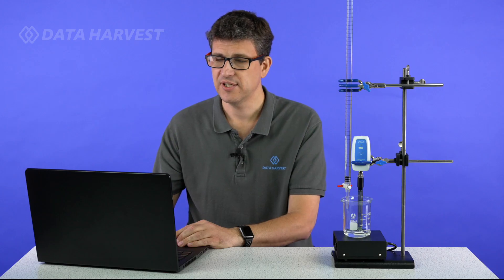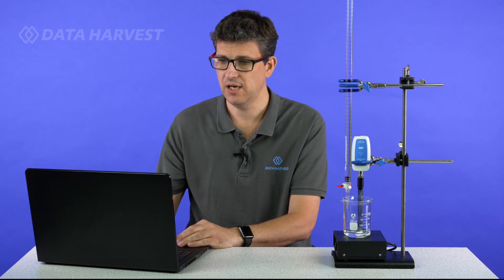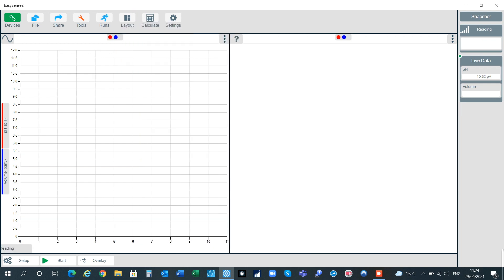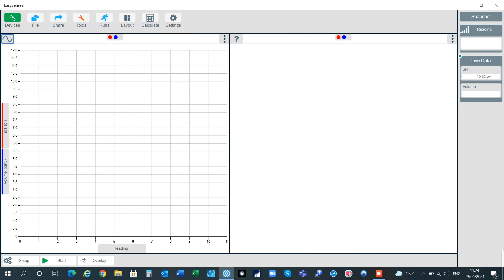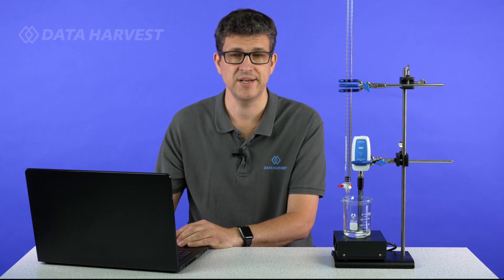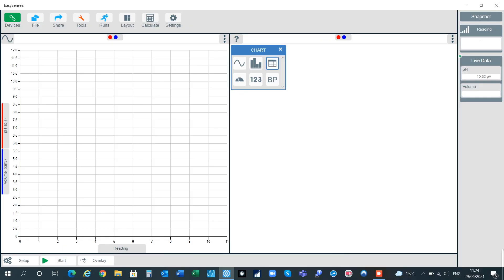Now I'm also going to change the layout of the graph. You could just keep one graph but I want to have two graphs on here. Line graph on that one is absolutely fine but once you click on the sub graphs in the top left hand corner you have six different ways to actually set the graph up. This time I just want it as a table so you can have that there as well.